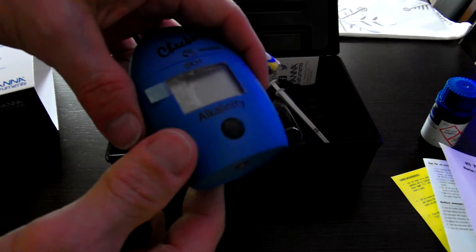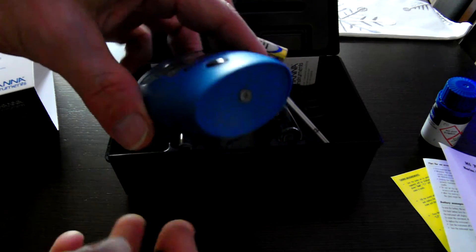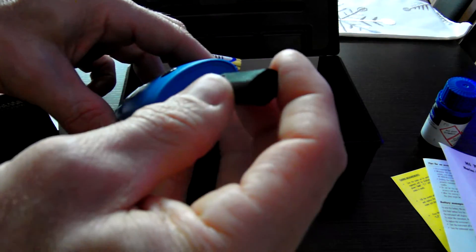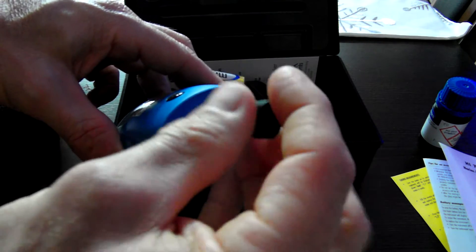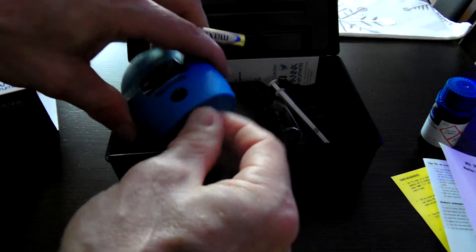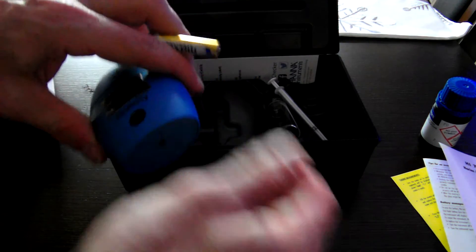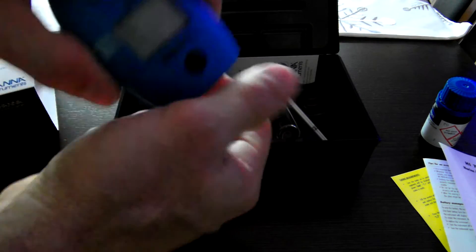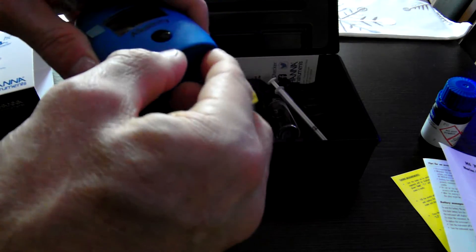So in order to get the battery in this new fresh out of the box Hanna Checker, there's a little Phillips screw at the base of the unit. They do provide a triple A battery. Of course, nothing's perfectly easy.